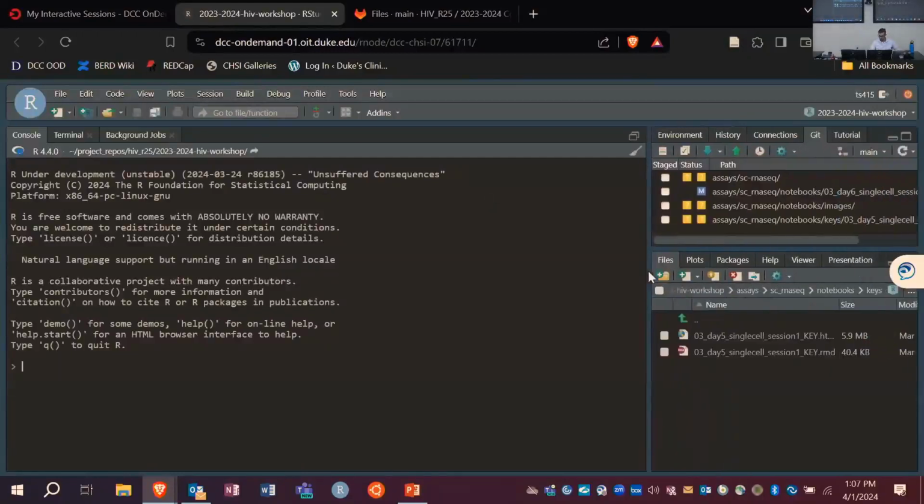And we will need to pull the latest content. So if you'll go to this Git tab on the upper right here. Oh, and I like this dark mode. If anybody has an issue reading anything, please let me know, and I can switch. It's sort of my preferred theme.